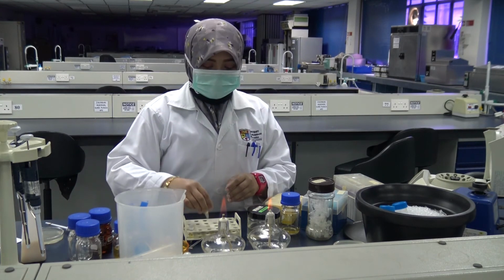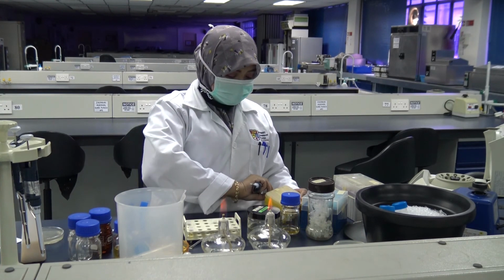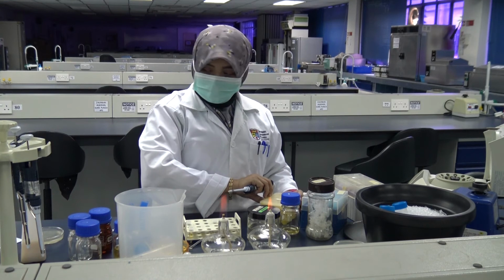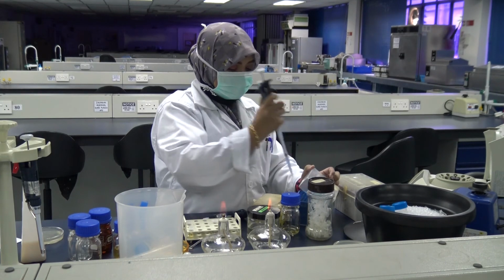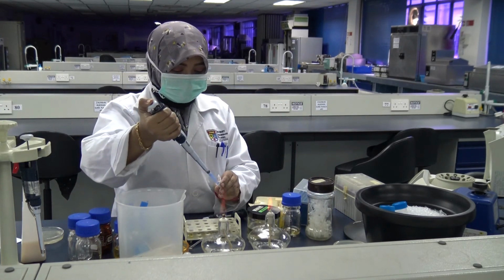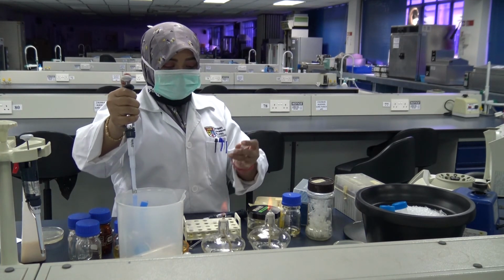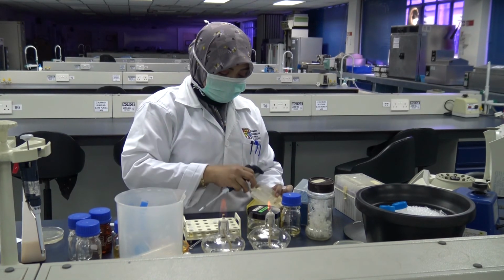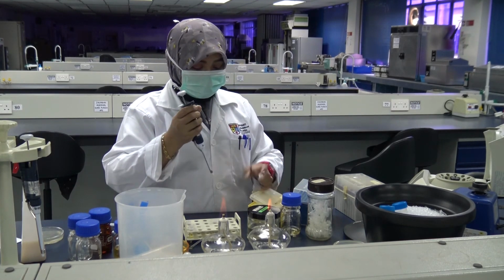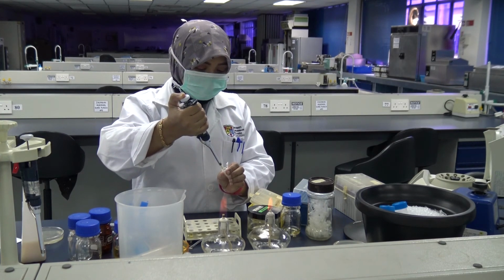Okay, this one, Fonzyma is going to demonstrate the transfer of the 10 to the minus 4 dilution. Remove 80 to 90% of the supernatant, leaving only about 100 microliters here. And then mixing the cell pellets properly using the pipette tip, and then transfer this onto a nutrient agar plate.